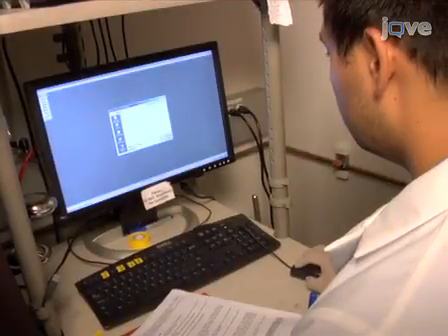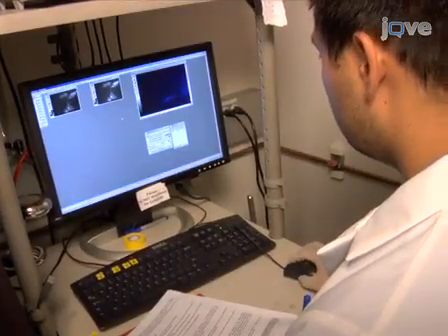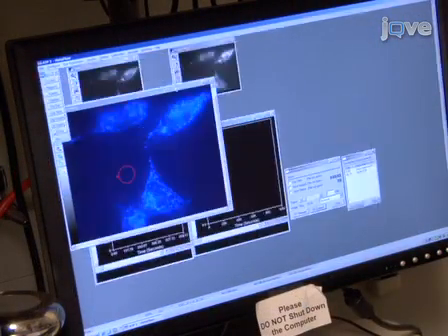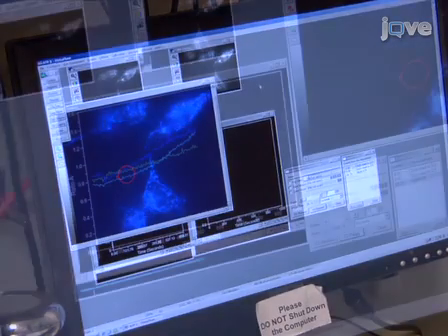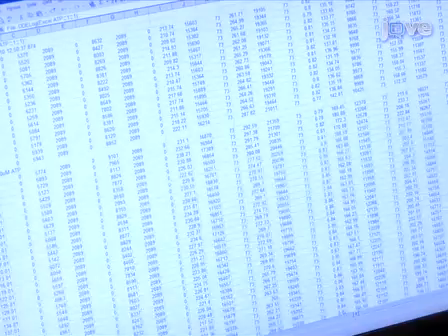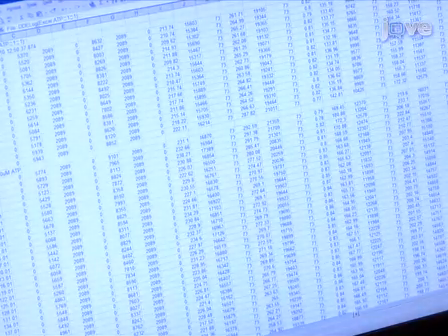Once the experiment is complete, images can be analyzed offline. To begin analysis, select a region of interest within an empty area of the field to subtract background fluorescence if necessary. Next, export the 495-380 ratio measurements from the region of interest to Excel or similar graphing software.